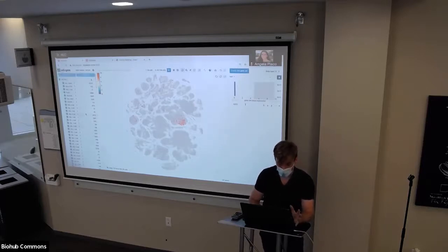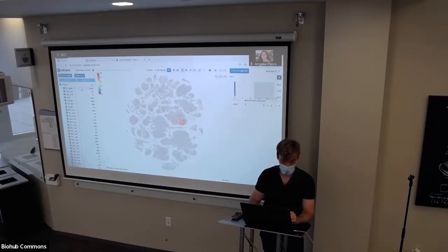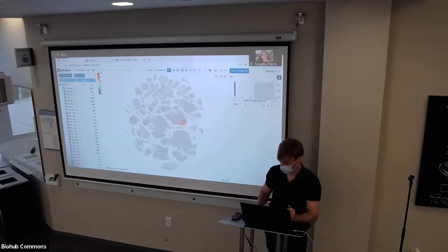That would be one way you could just scroll through and see. Alternatively, a nice feature that would be good to add, which I am going to write down, is a sort button. You can sort the ordering of these labels based on their colored continuous metadata. I think that would give you exactly what you want. The top 3 would be the top 3 expressing on average, and then you would just scroll to the bottom for the bottom 3 expression, or you would just hit the arrow and reverse the direction.